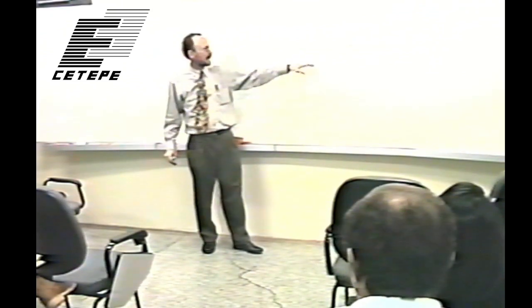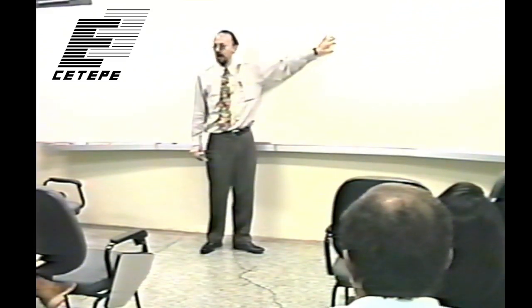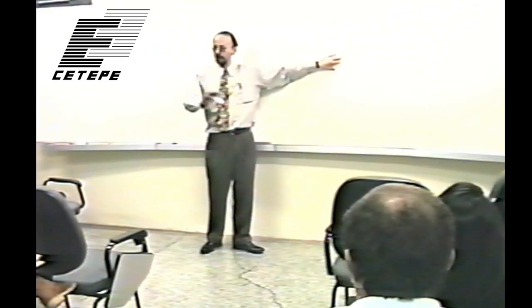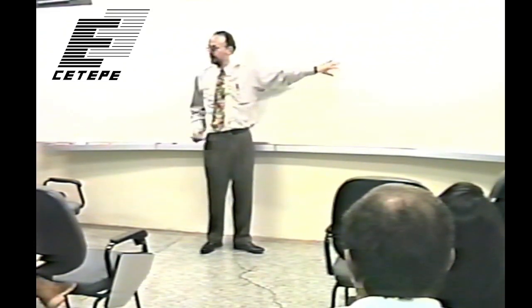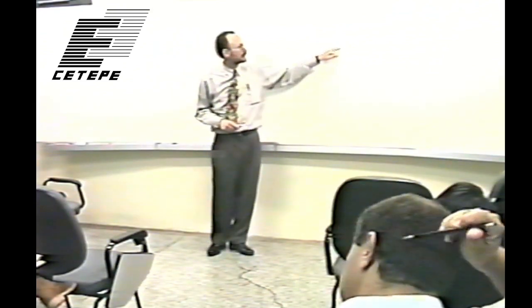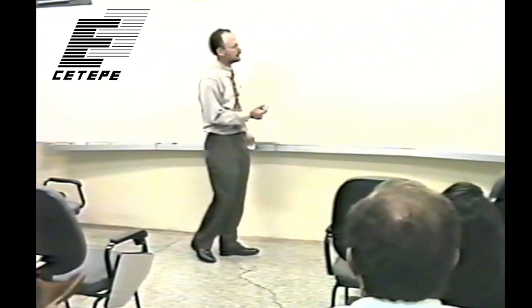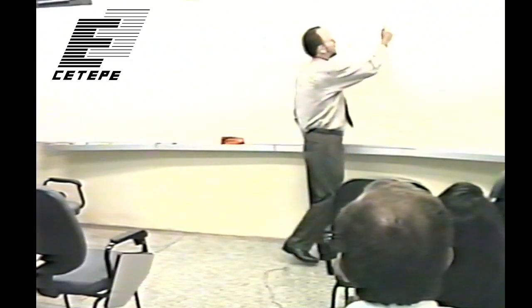And so often this back screen will be thicker and this one will be thinner. So this one would optimize the fine detail, and this one would optimize the low frequency, but get lots of exposure. I'd like to talk a little bit about why a thin screen optimizes fine detail. And it's pretty easy to do, but maybe I should blow it up a bit more.